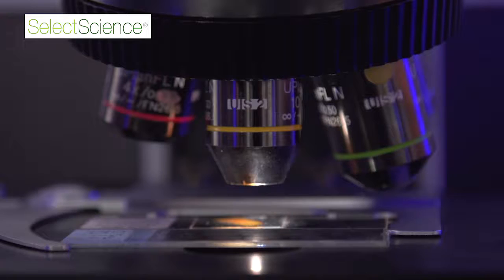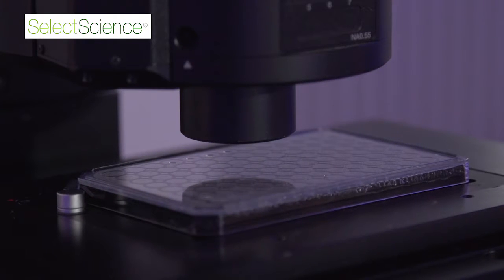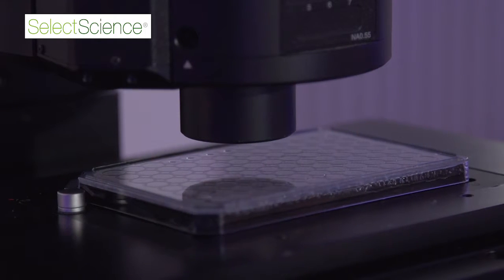So what we want to do is work with weak expression levels of our fluorescent proteins, for example. So we have weak signals. On the other hand, to do proper spectroscopy, we need to collect a lot of photons. So what we need from a microscope system is the best sensitivity we can get. For us it's very, very important that all the optical parts in the system are almost perfect and that we can really squeeze out every photon that is available from our sample. That's most important for us.